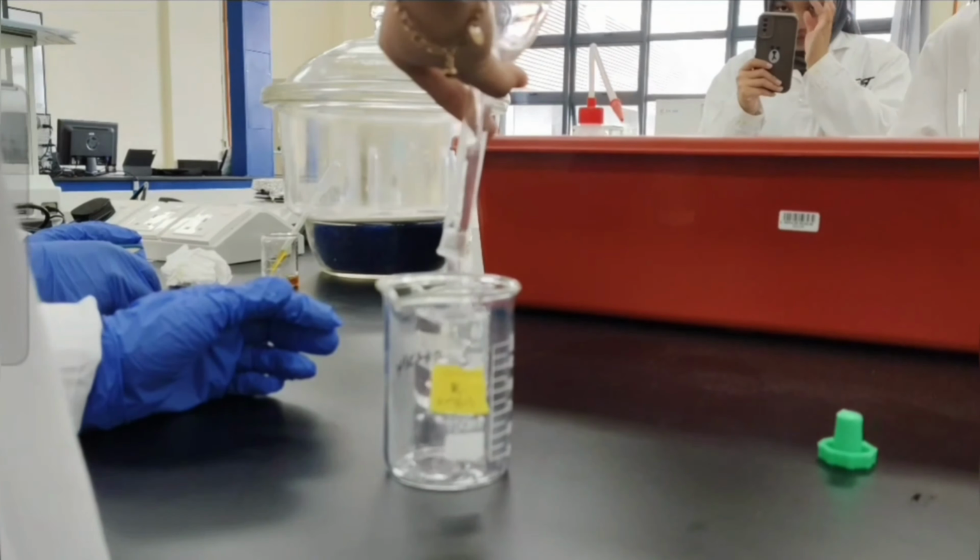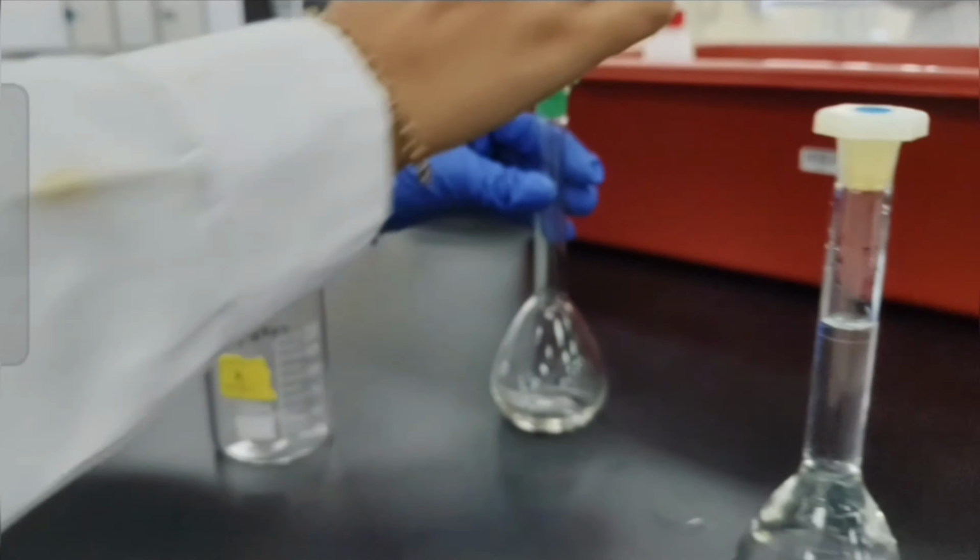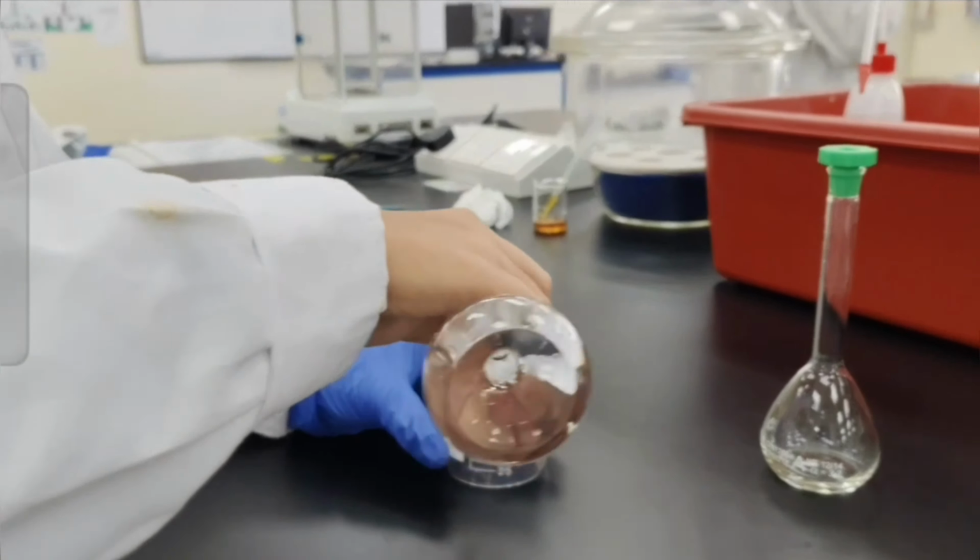Then we transfer the stock solution to a more suitable container so that it is easier to be analyzed by the instrument. In this case, it's a beaker.